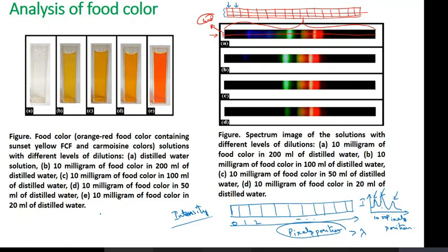From a known source, you will be getting wavelength versus intensity. So for a known source, you'll be getting a plot like this. And you know this is lambda 1, this is lambda 2, this is lambda 3. So you can calculate these. And from here you have the pixel positions versus the wavelength positions, and you can get the information. So this is how you can calibrate the sensor over here.